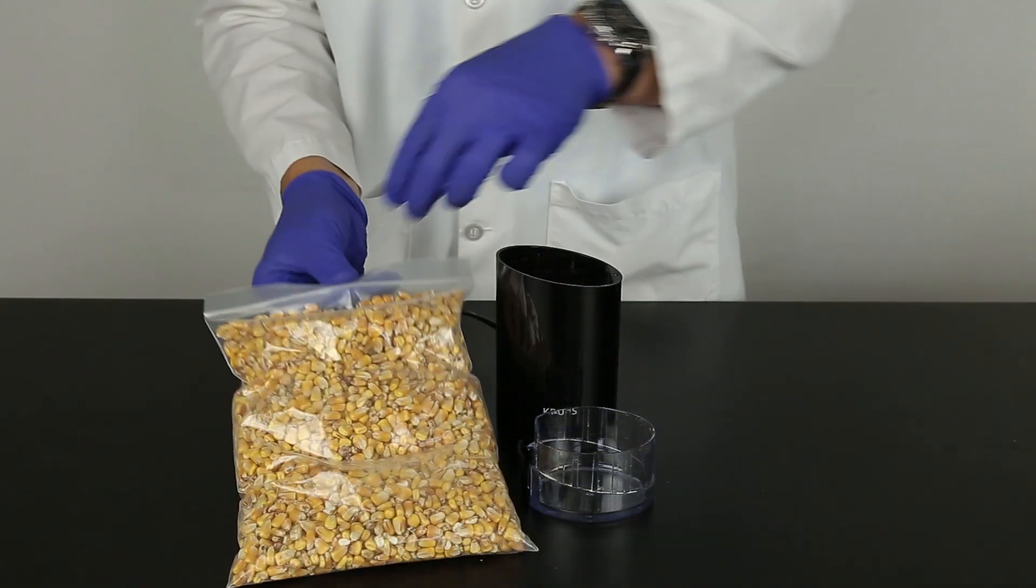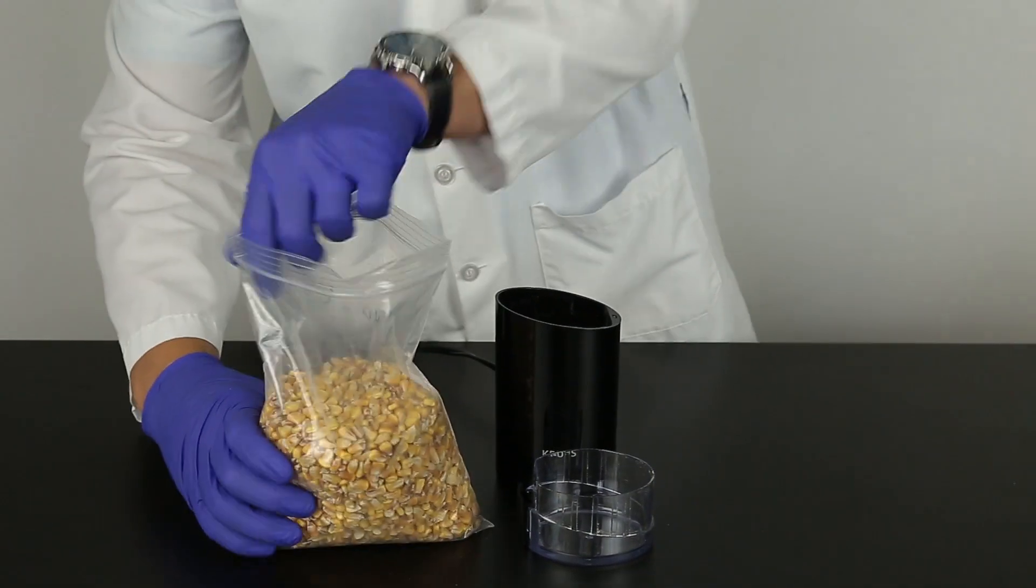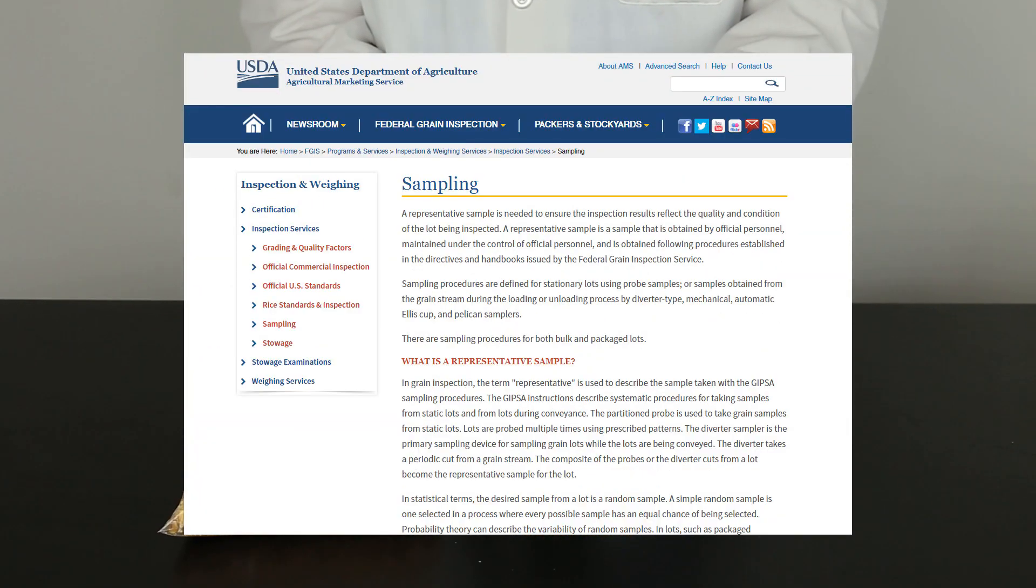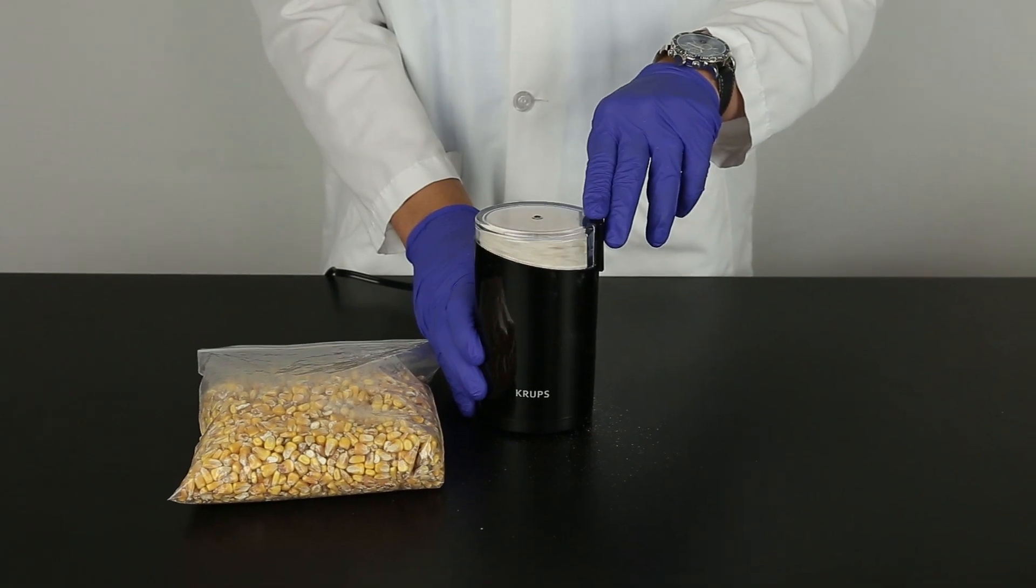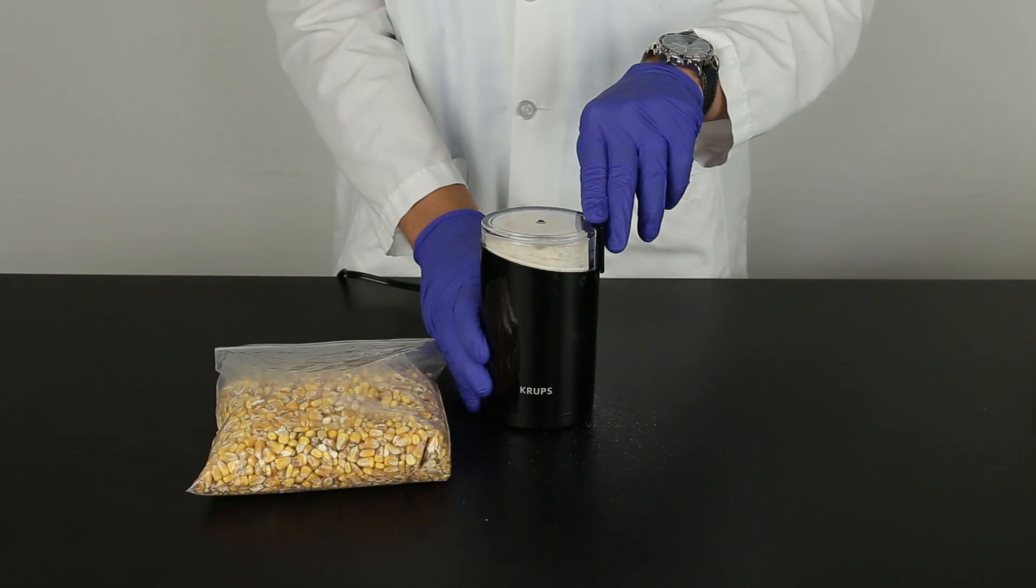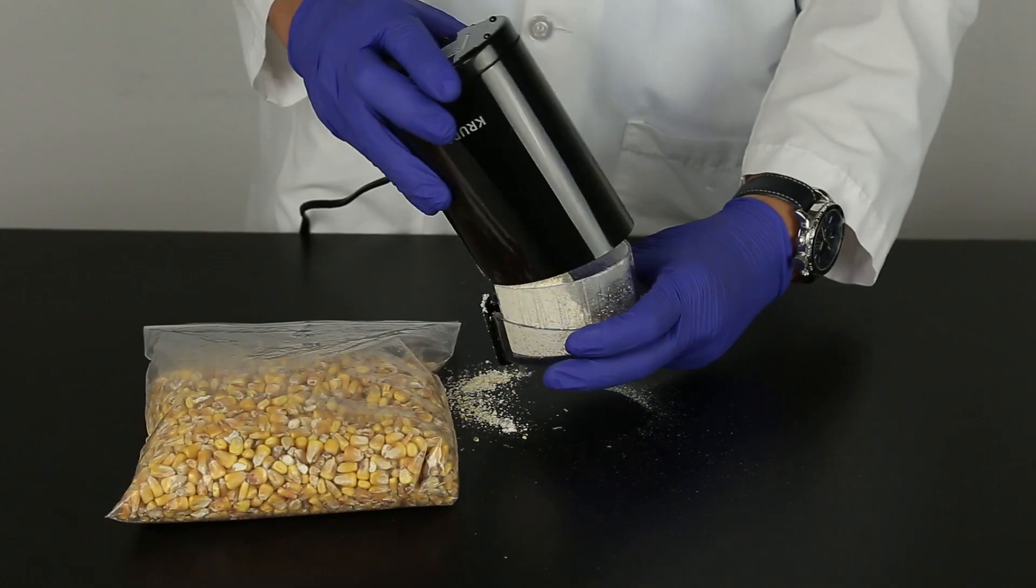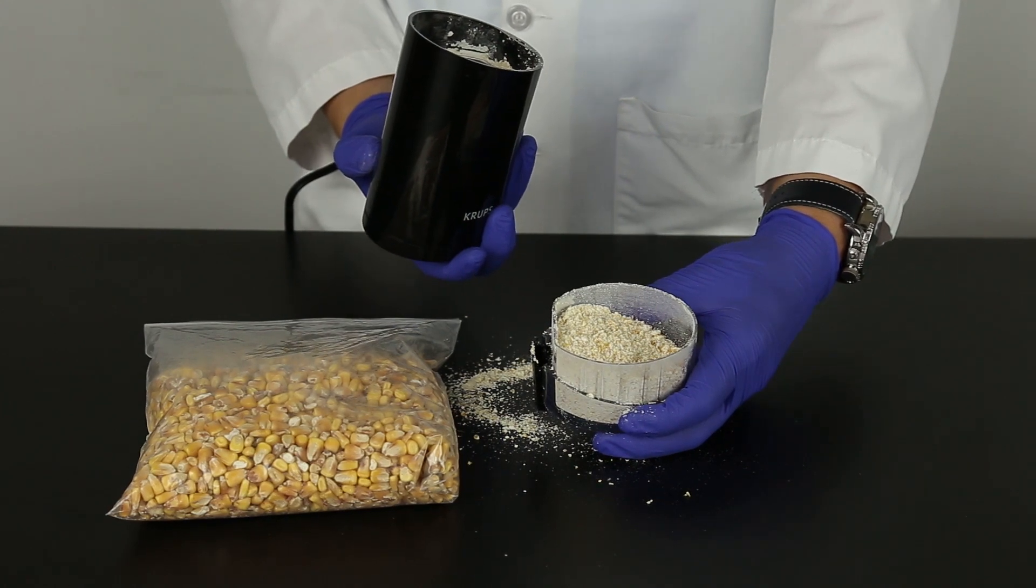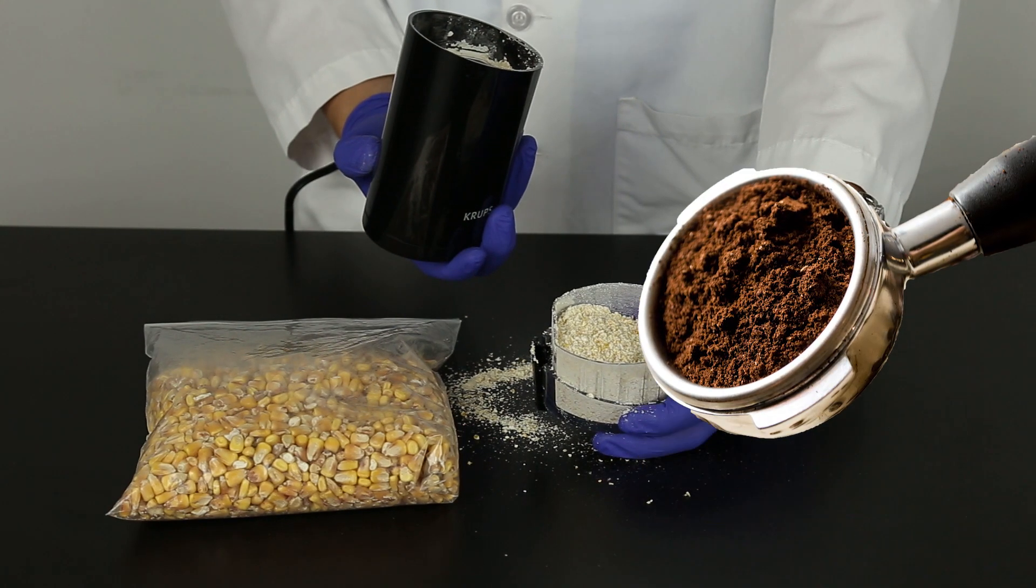The sample to be tested should be collected according to accepted sampling techniques. See the FGIS sampling protocol or contact your Neogen representative. Obtain a representative sample and grind so that at least 95 percent of the ground material passes through a 20 mesh sieve. The particle size should be about the same as espresso.